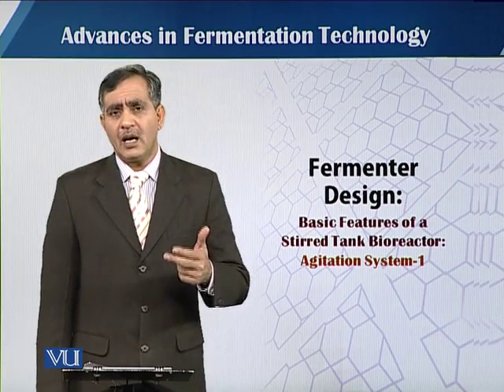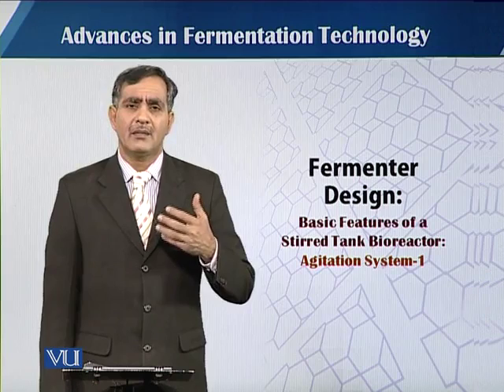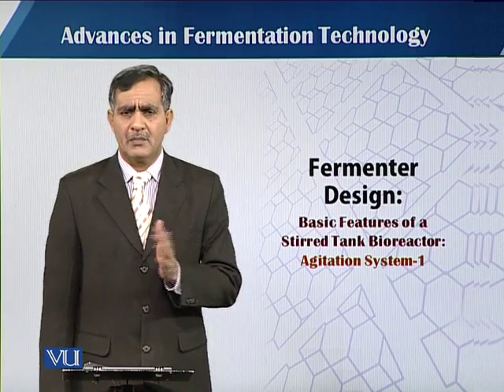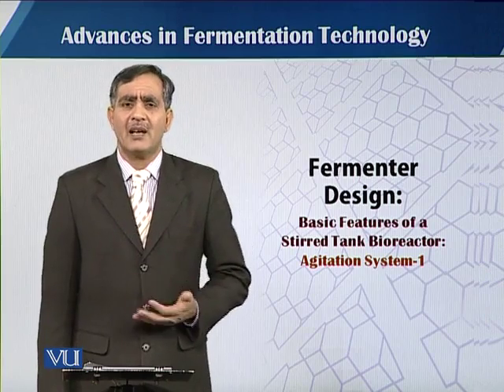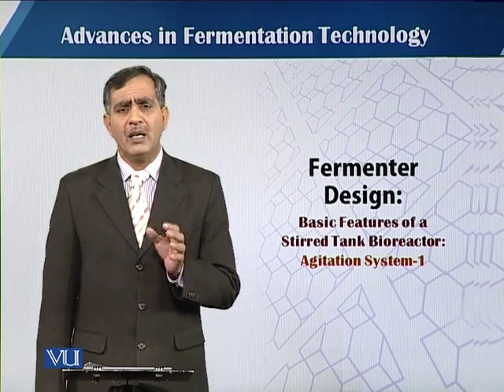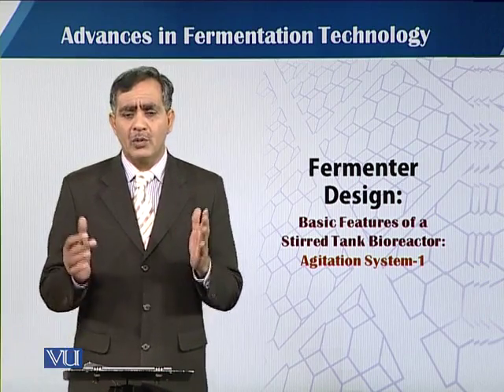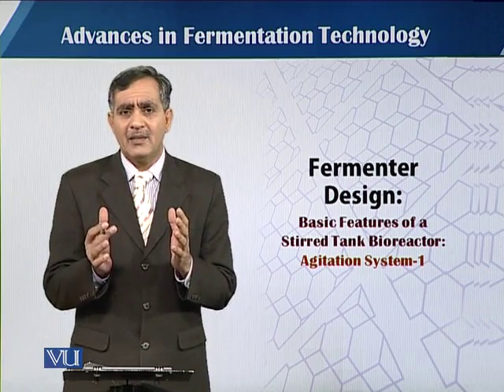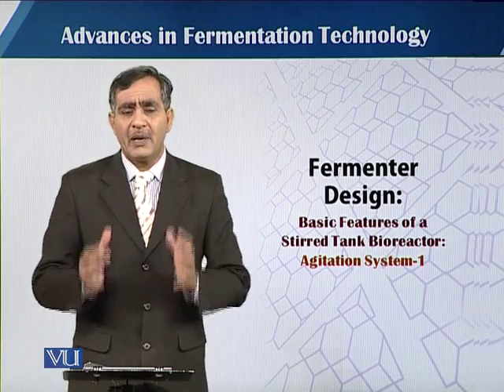These three are the basic components of a fermenter. We are not talking about the accessories of any fermenter. We are talking about those parts or components which are directly attached in a fermenter.